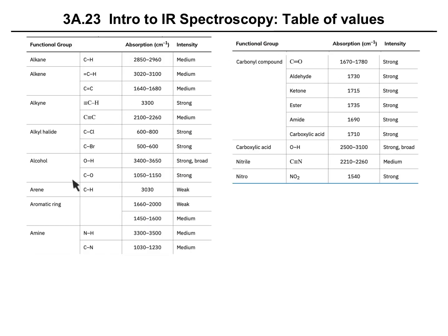Here we have a table of IR values. This is taken from McMurry's Organic Chemistry 10th edition. It lists a variety of functional groups and just bonds, and it gives the common absorption range and a little bit about the characteristics. I will provide this on quizzes and exams, so you don't have to memorize all of these values. What's very important, number one, is that you know how to use this table. I don't want folks to misread what a particular signal corresponds to.